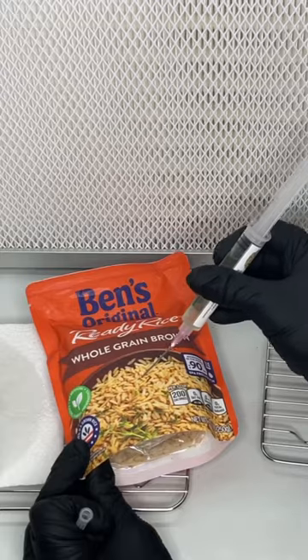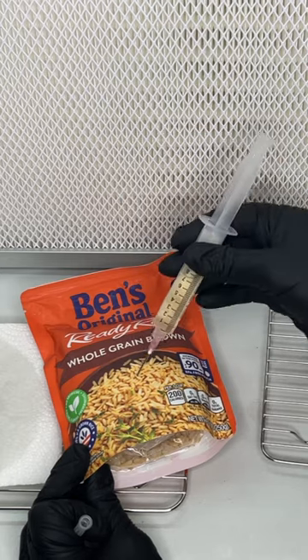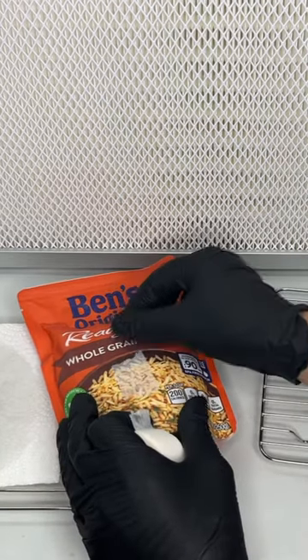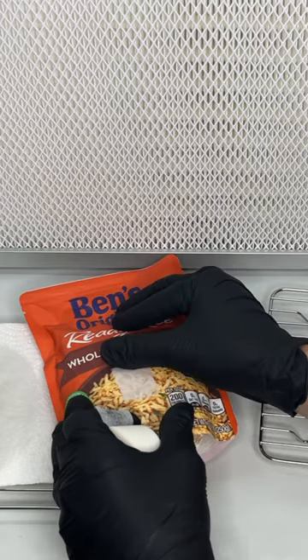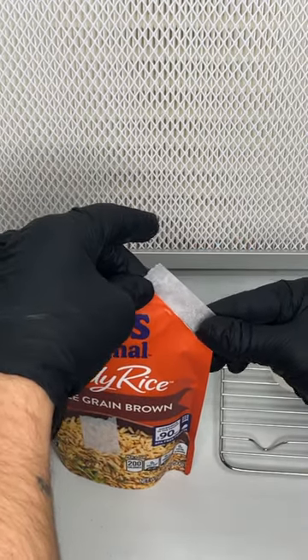The first thing I did was wipe the bag down with isopropyl alcohol and then inject two milliliters of lion's mane liquid culture. After injecting the liquid culture, I covered the injection site with two layers of micropore tape, then cut the corner off the bag and applied another layer of tape.